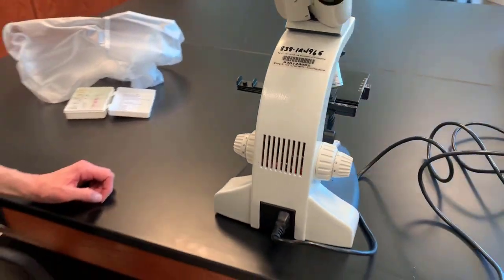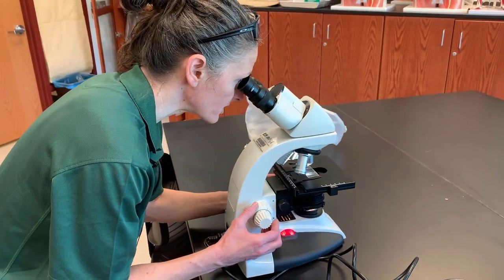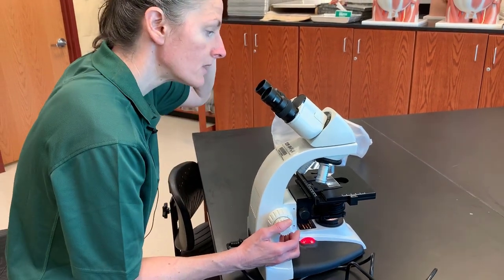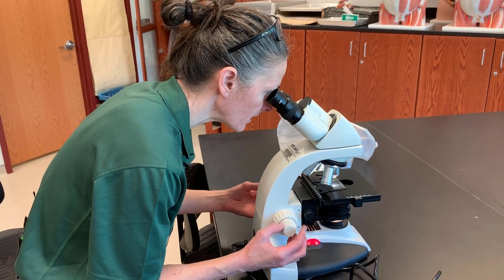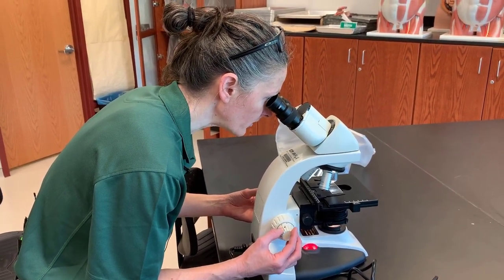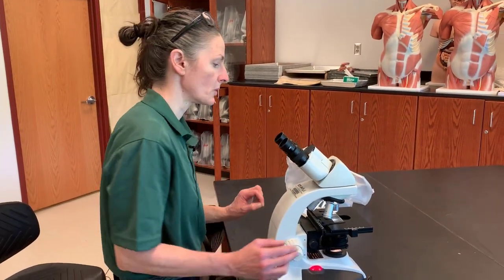Once we have our subject where we want it, we use our coarse focus until we can see the image. Then we will use our fine focus until we get the image into a clear focus. Once we have done that — and only then — can we move up to a higher power.